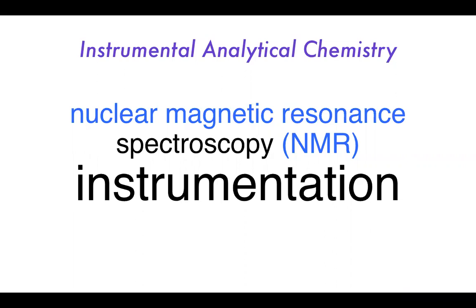And analogous to maybe our UV-vis or our FTIR measurements, we're able to leverage that difference in energy to try and get a spectral measurement or some spectroscopy out of the sample. We discussed also the idea of these nuclei having spin, and the nuclei that were of most use to us as analytical or instrumental chemists were hydrogen, carbon, phosphorus, and you could also look at nitrogen to an extent. You could look at sodium as well, although those tend not to really be looked at that much.